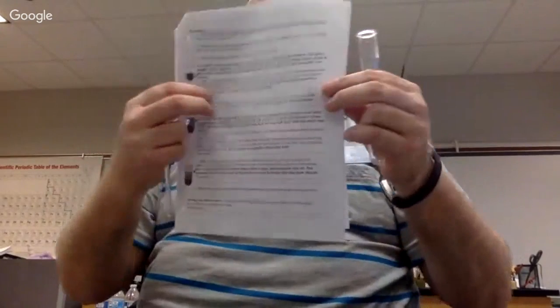So can I be clear? In the data table, you're going to write as soon as you put the things together. Here, you're going to write after you've stirred them together. Now, after you stir them together, won't this glass stirring rod be contaminated with whatever you have in there? So you're going to wash it off, and you're going to dry it off so you can use it in the next step. Are you with me?